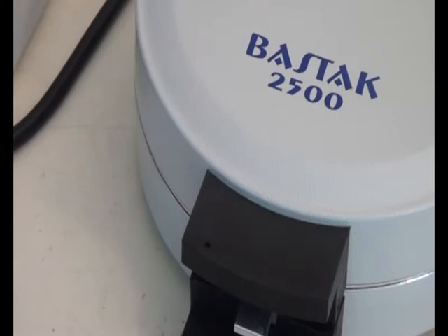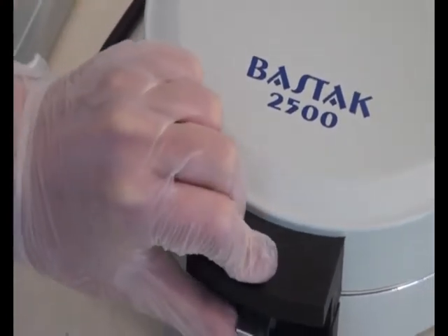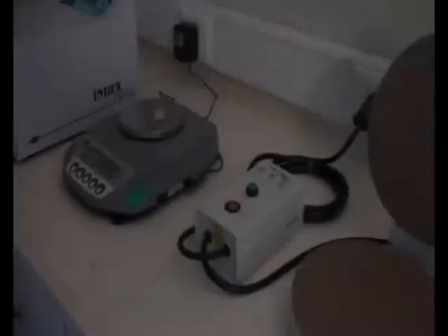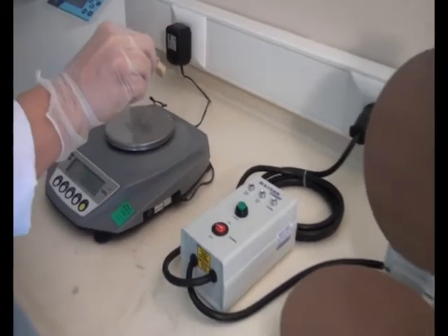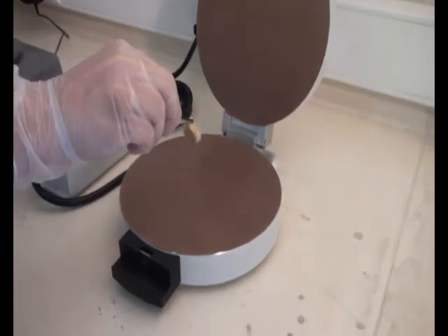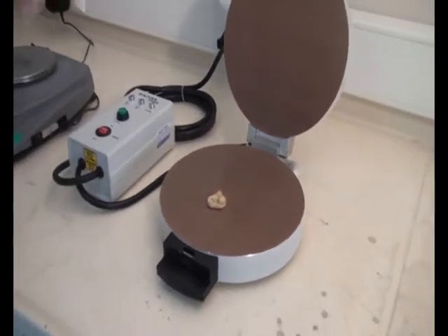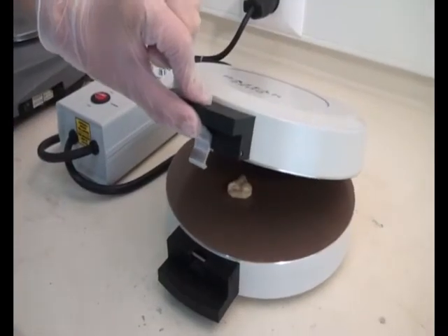Open the cover of the instrument and place the wet gluten, which has already been prepared using the Bastak gluten washer, inside the dry gluten instrument. Then close the cover and make sure that the lock is all set.